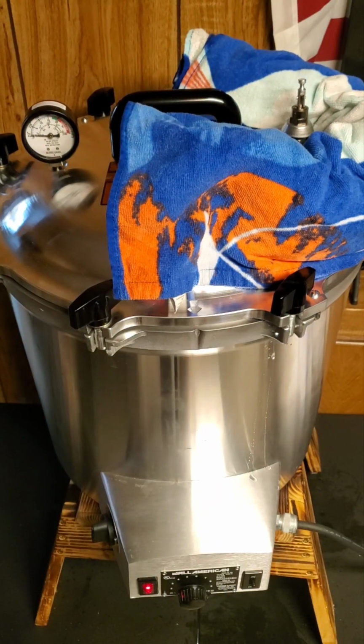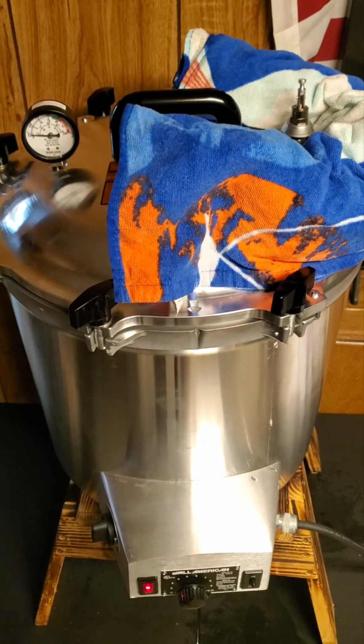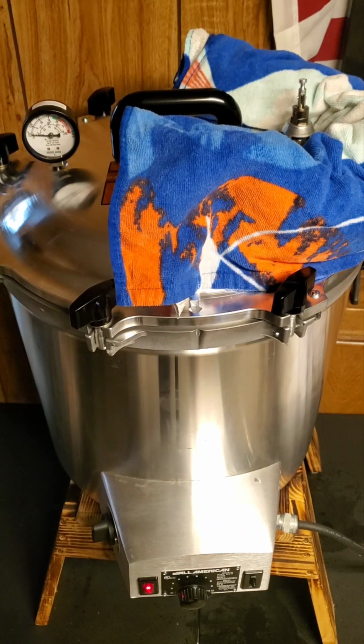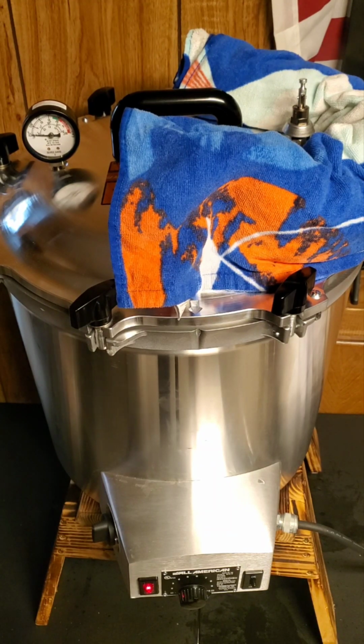I'm going to do that for this 5 minutes. All right, and when this 5 minutes is up, that it's clearing out this water, it's steaming, I know the steam's really getting through there, then I'm gonna shut it off. In the manual, it says to steam it for 5 minutes, bring it to 15, then aerate it and bring it all the way back up. We're not gonna do that. I believe that's overkill for what we're doing here.